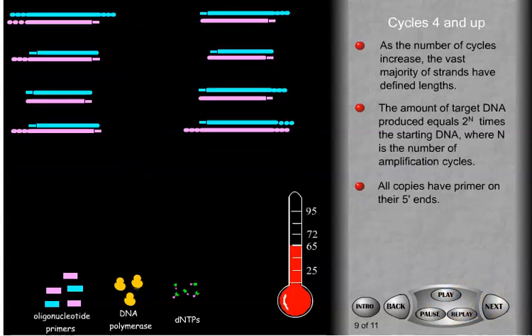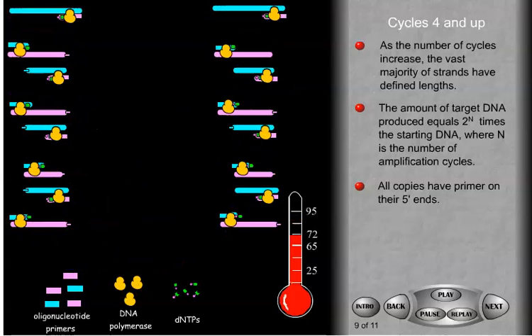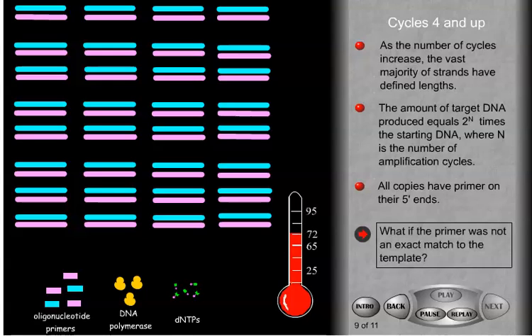The PCR reaction is typically continued through 20 to 50 cycles. Each cycle, the amount of DNA doubles. Quickly, virtually all the DNA in the reaction is of defined length, with the synthetic oligonucleotide on the 5' end.